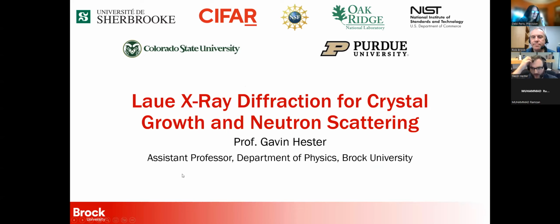So today I'm going to be talking about, as you might imagine, some Laue X-ray diffraction. I'm particularly going to be giving my very niche area of physics use for it, which is in doing crystal growth and preparing for neutron scattering experiments.